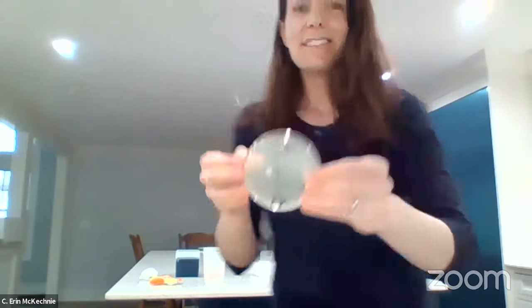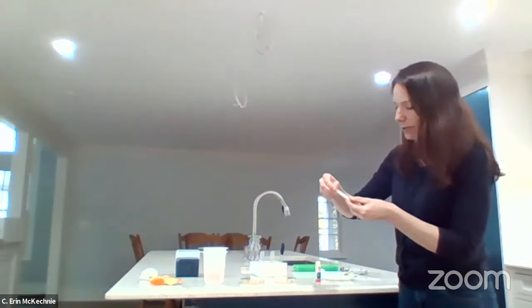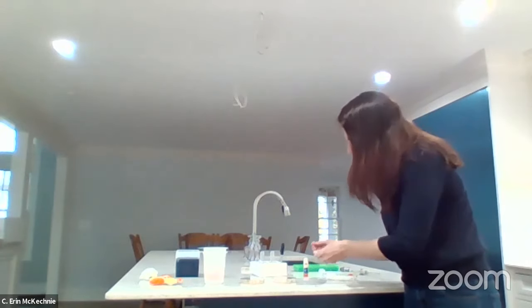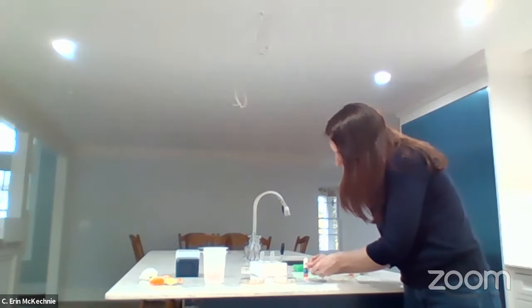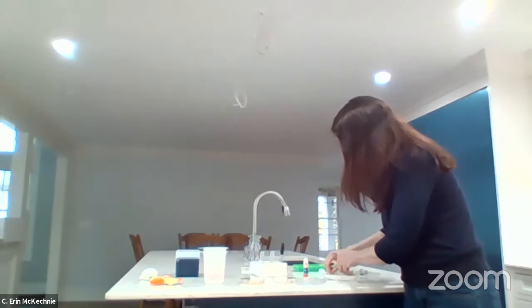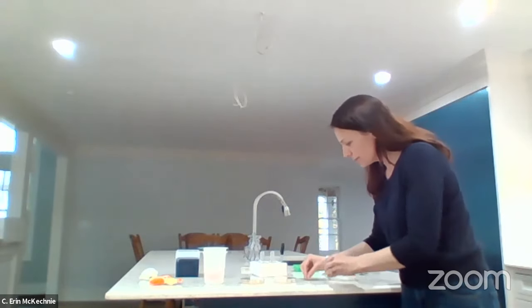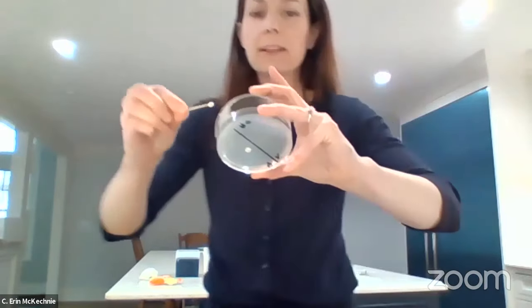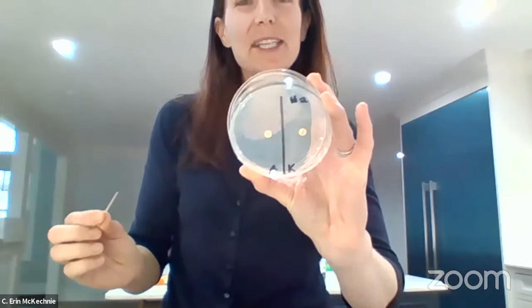Here it is. And now it's time for the kanamycin. So this is my kanamycin one. I'm just going to push them onto the countertop like I did before. 1, 2. Get a little glue. Touch it gently. Okay. Just going to add it just like that. So there are 2 antibiotics on the plate and they're not touching each other.